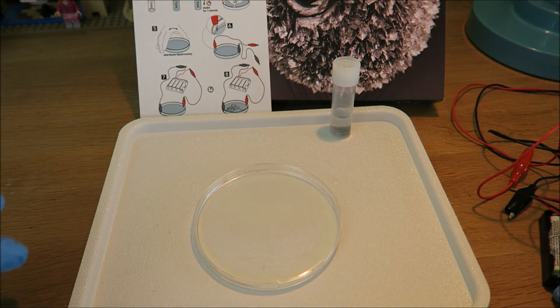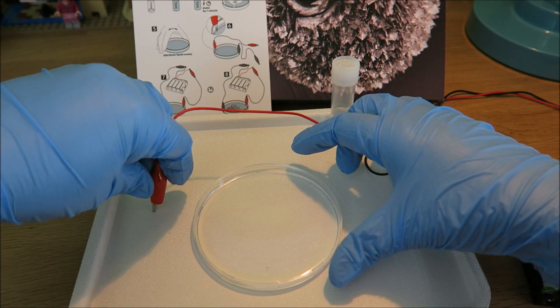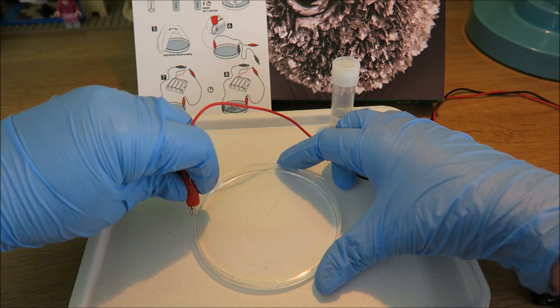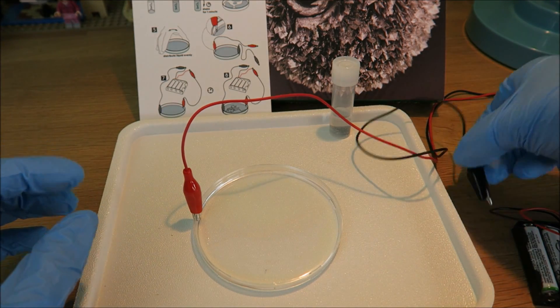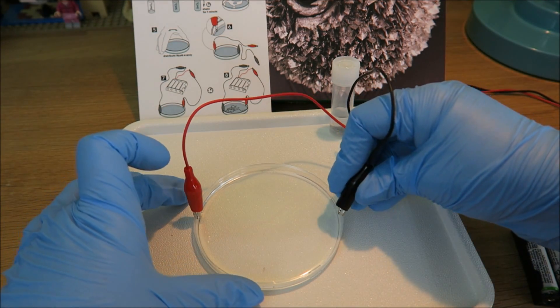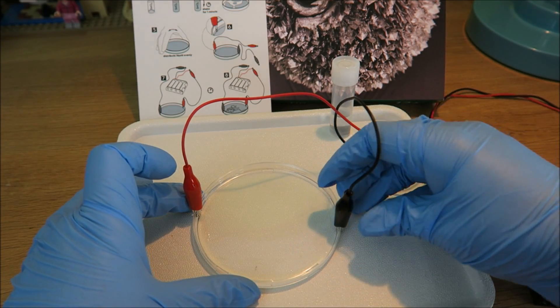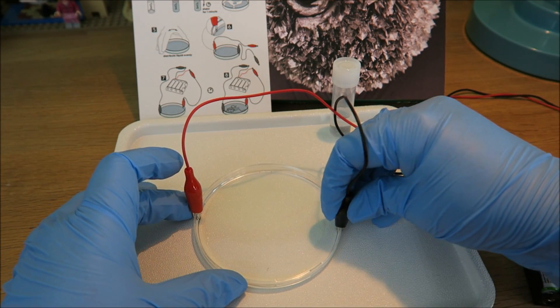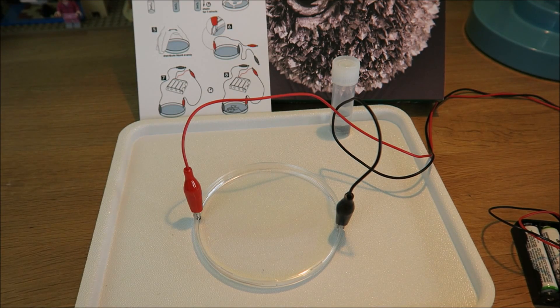And then I have my power pack with my red and black cables. Pop those on there, either side of the petri dish. Get that deep down into the liquid and we watch what happens.